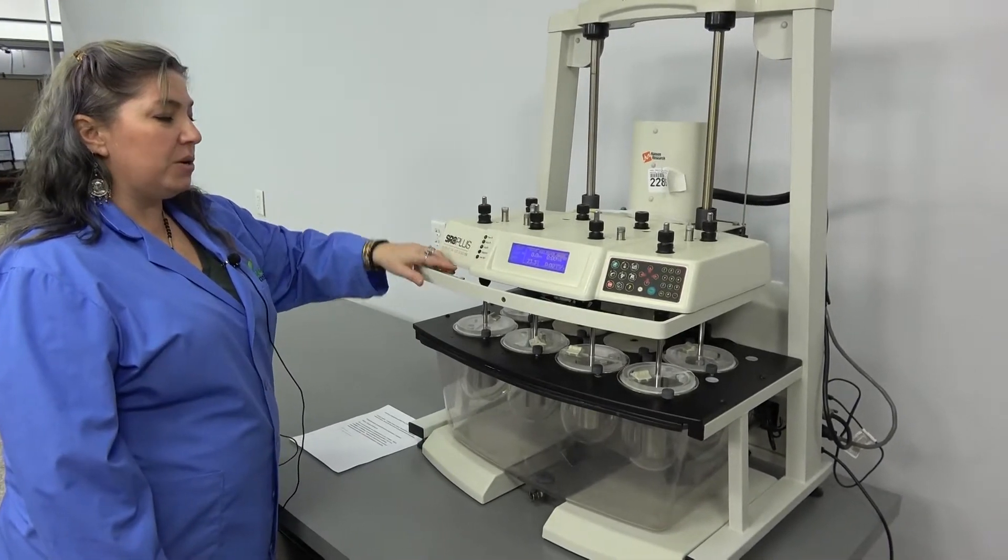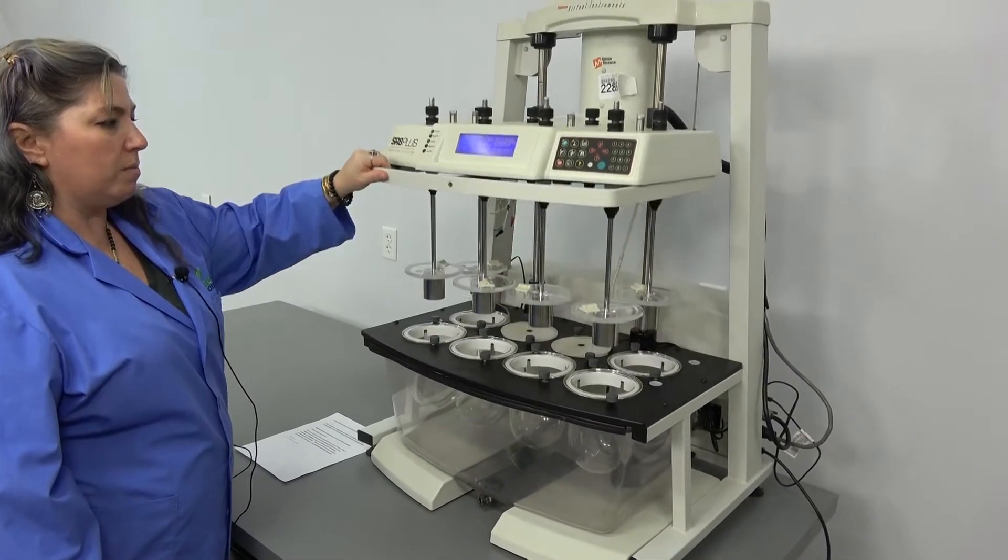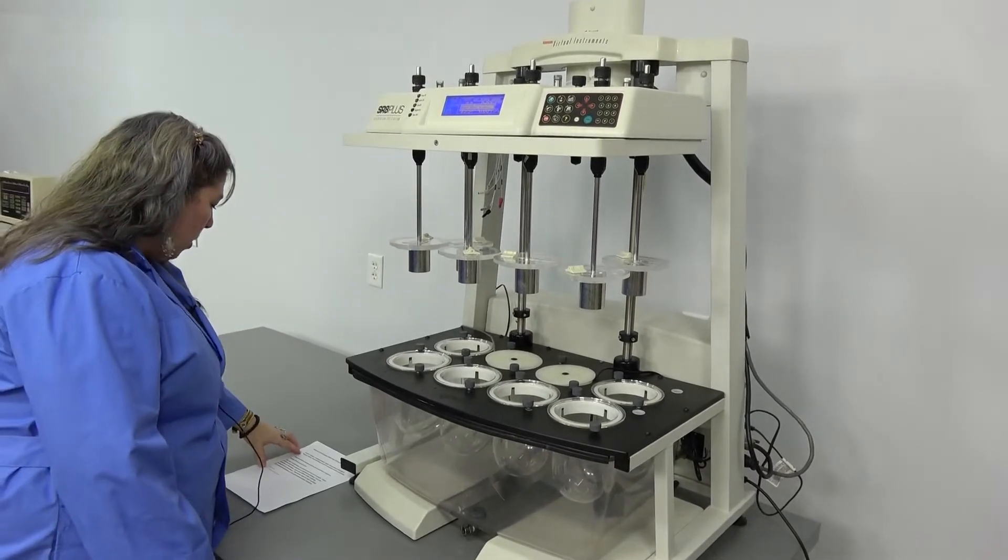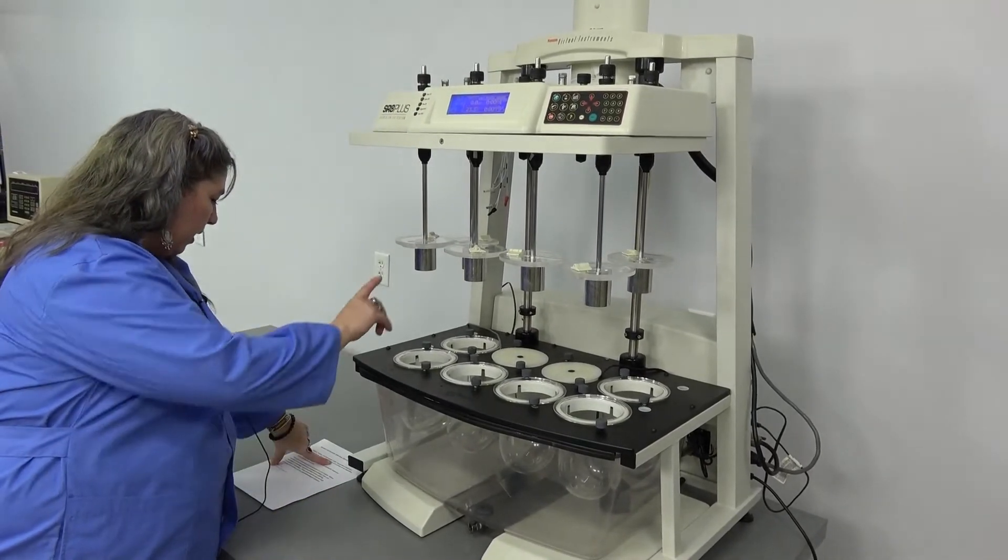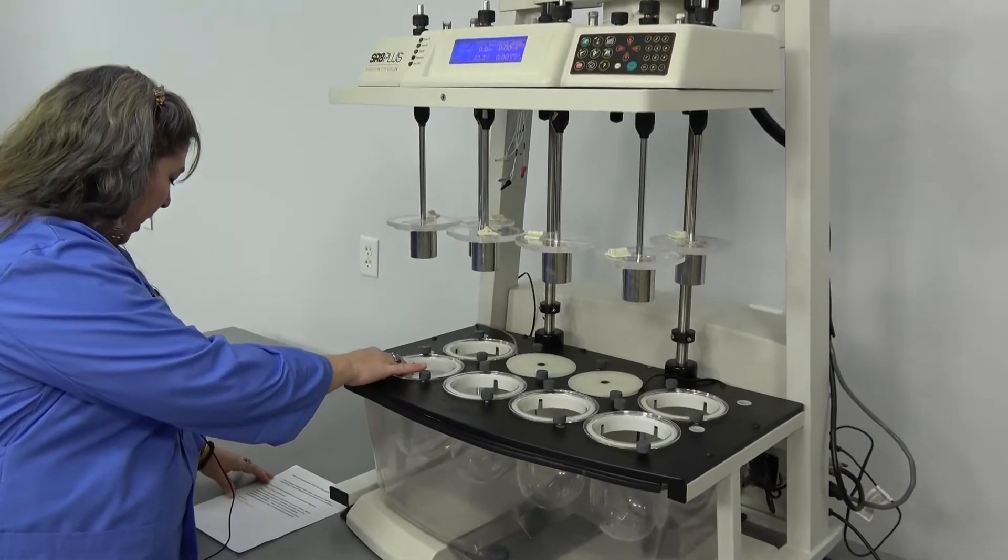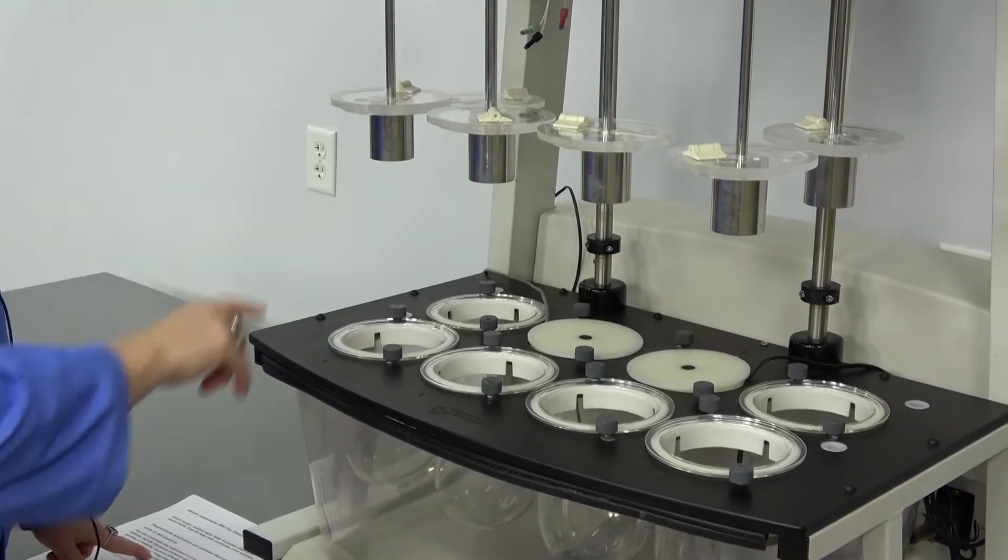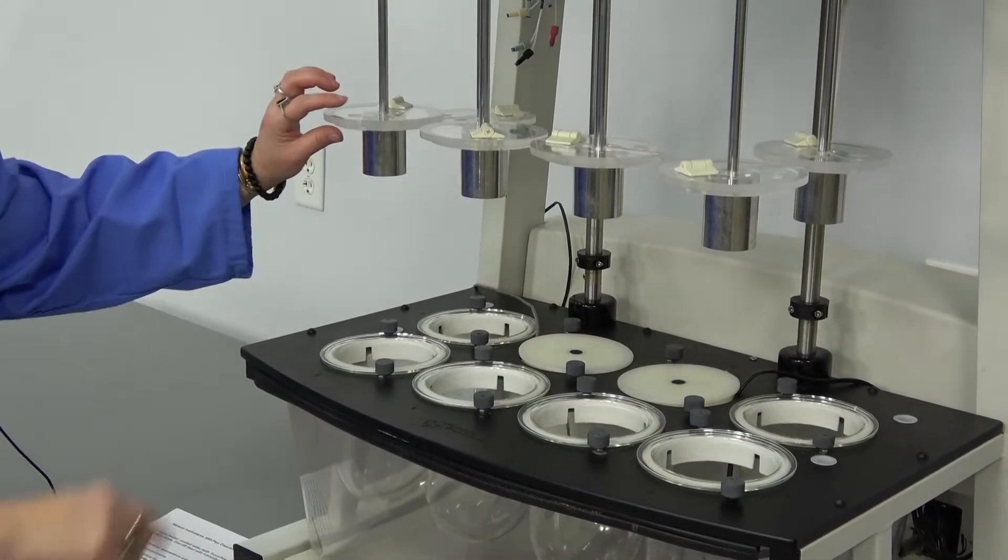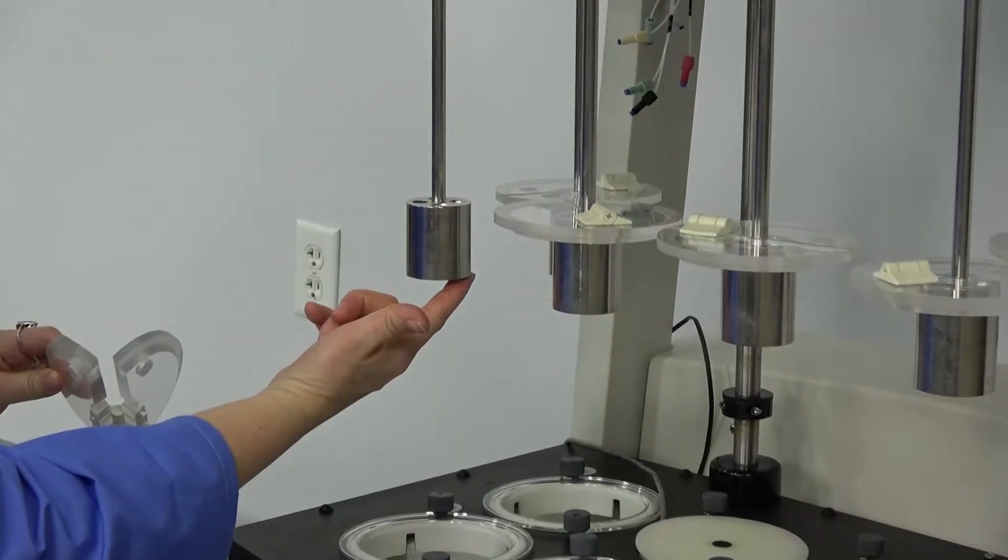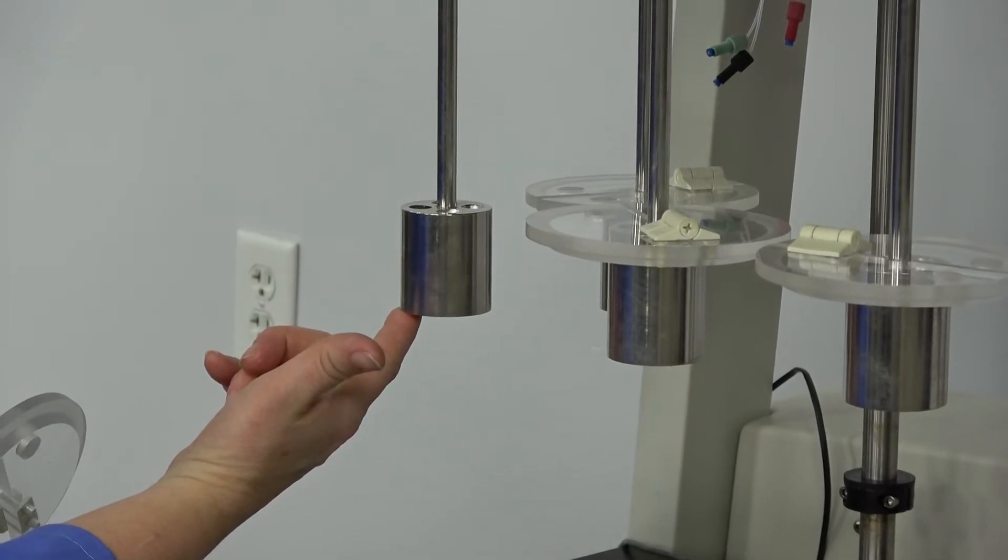It has an easy raise handle. You squeeze in the trigger and you can manually pull this up. Ours happen to come with six reaction vessels and at the moment ours are affixed with rotating transdermal cylinders. These are used when you're testing transdermally delivered patches.